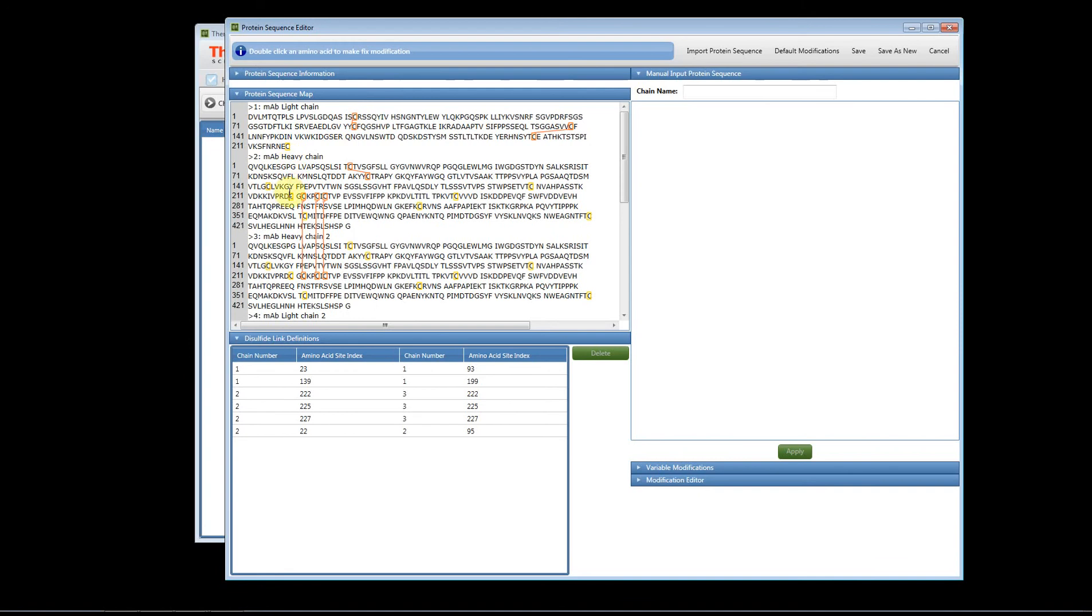The cysteines must not have static modifications in order to link them together. This shows you how to link the disulfide bonds for an intact molecular weight analysis for an antibody. Thank you.